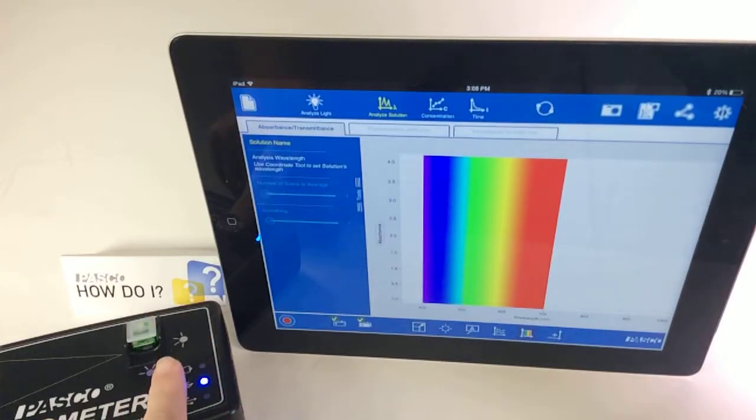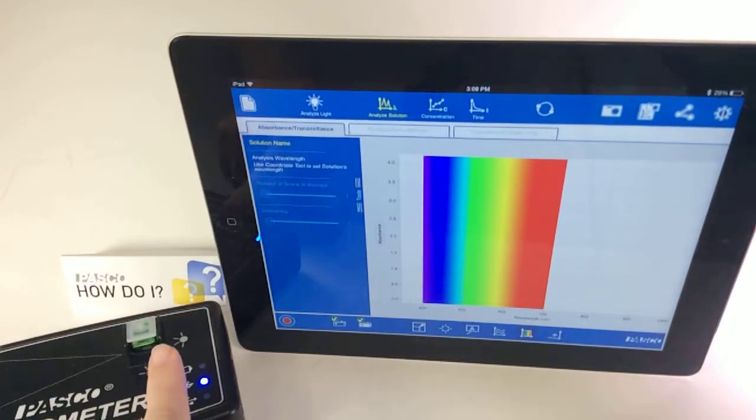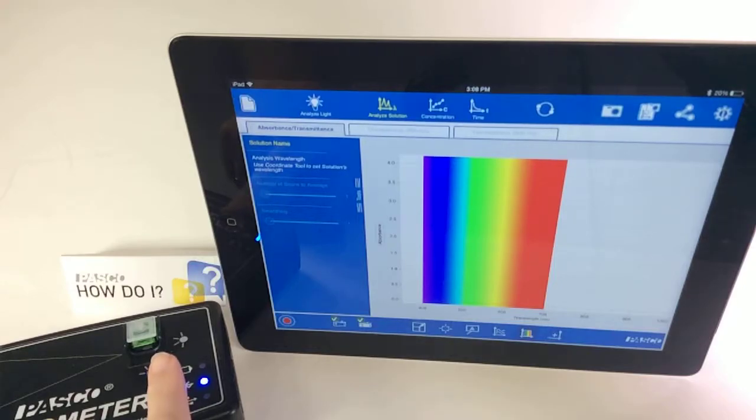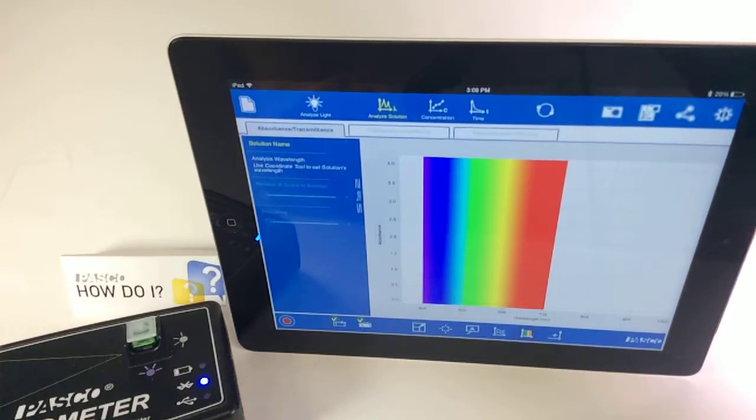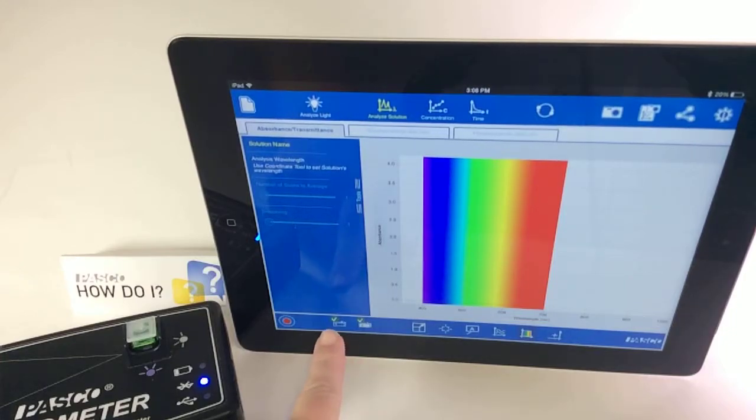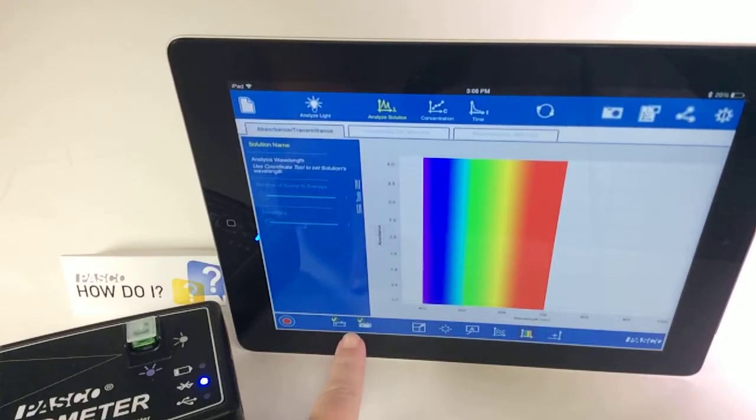I've already connected or paired my Bluetooth wireless spectrometer to the iPad, and I've already performed the light and dark calibration procedure.